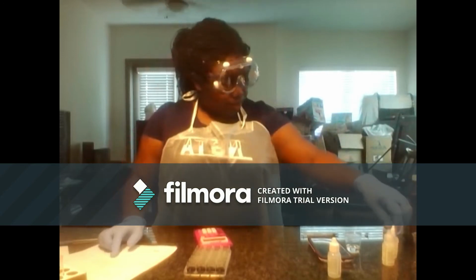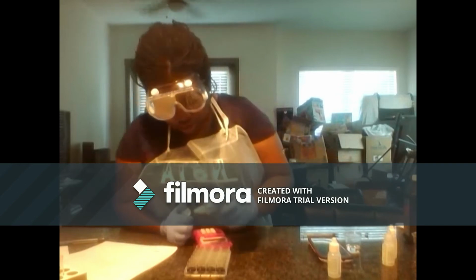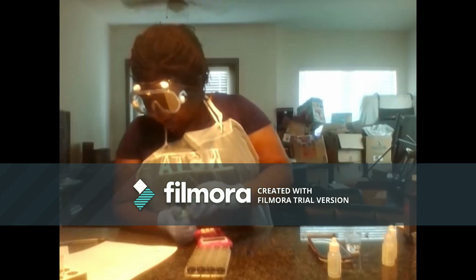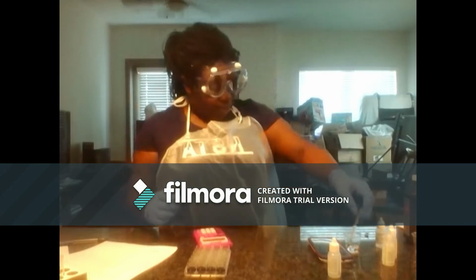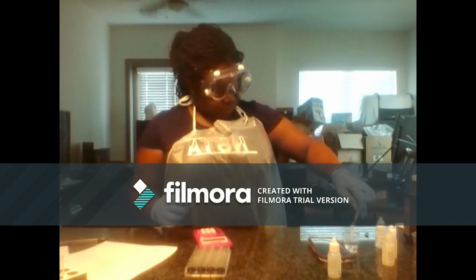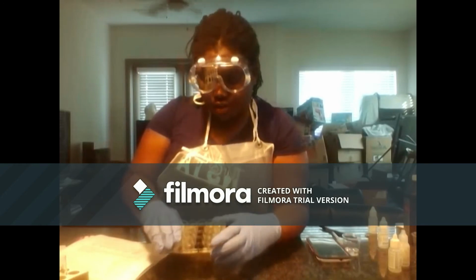And 8 drops of sodium thiosulfate. And 0.4 mLs of hydrogen peroxide. Okay, so here's my completed trials 7 and 8, all 4 of them.